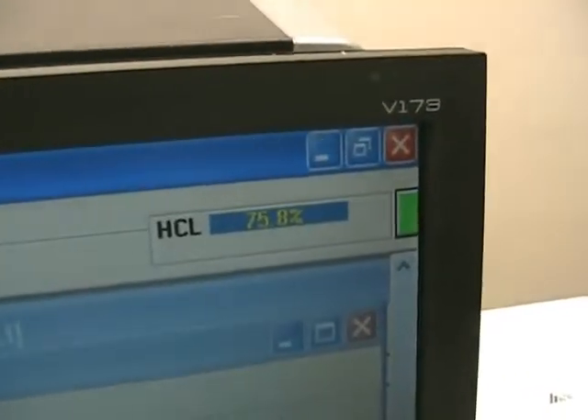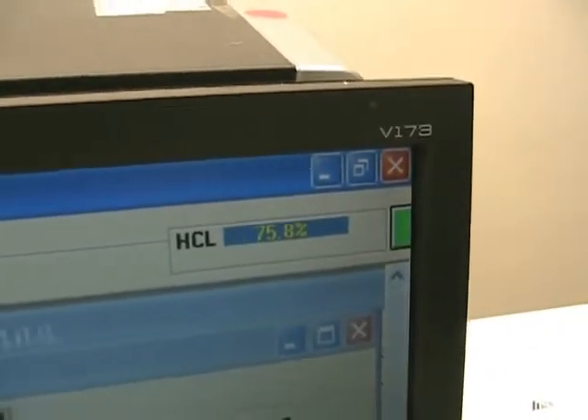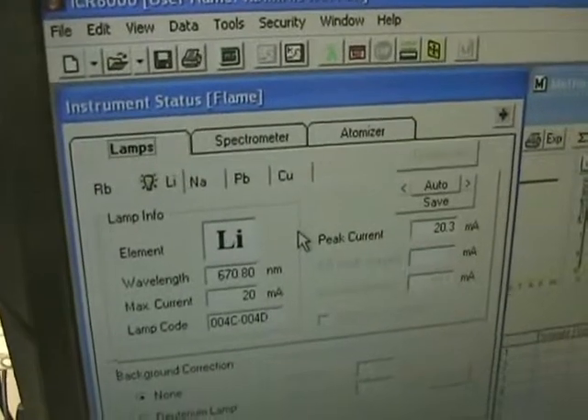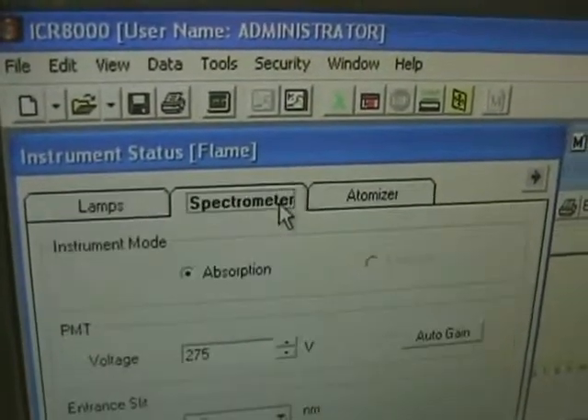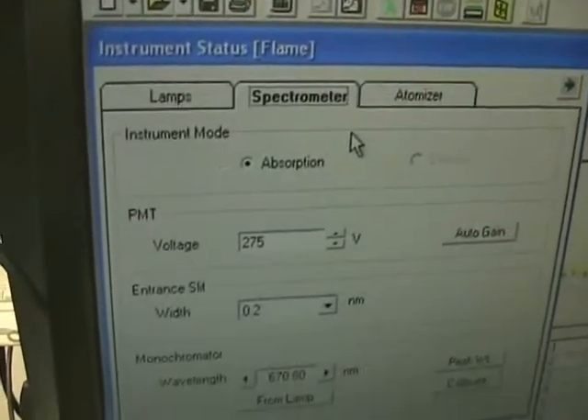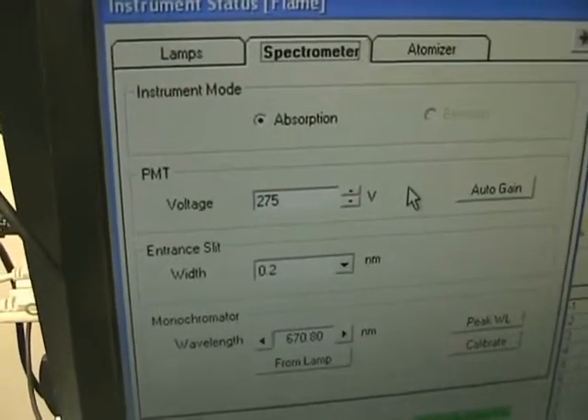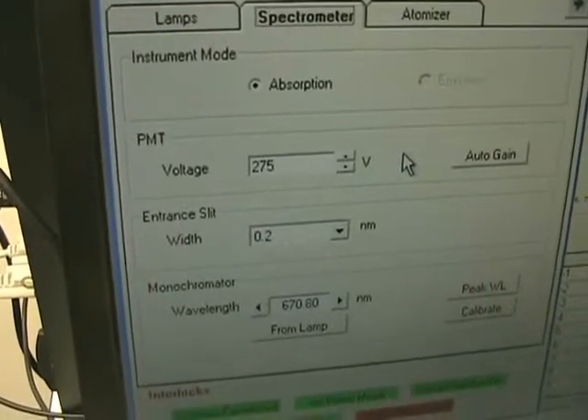Up in that corner it gives you a continual reading of your energy level, which is about 75% — that's what you want, because you need between 70 and 80% when running tests. Over on the next tab we have the spectrometer, where you can set the voltage to help balance and get you up to your 75%, all of which is in the manual included with this unit.